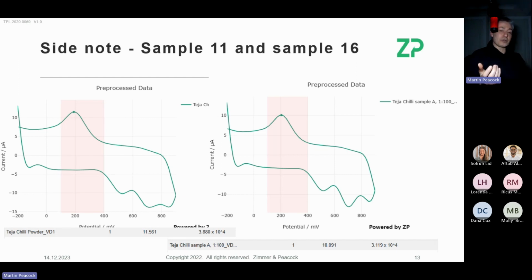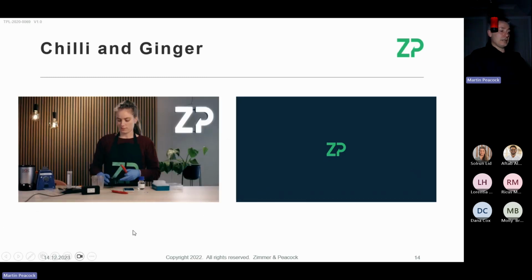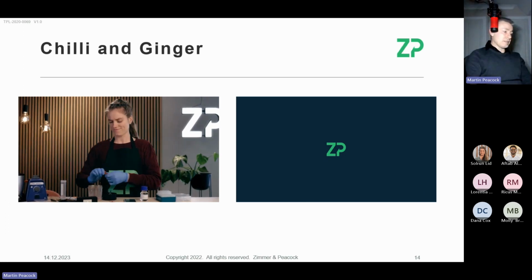We can't make this molecule appear. It's either there or it's not. And how much of it there is also out of our control, but it's quite a lot of molecule. So the certificate of analysis that they've got, they're paying for it, but it's actually not accurate because we can see the raw signal. This is something that you'll see in a bit that Solron will do today.